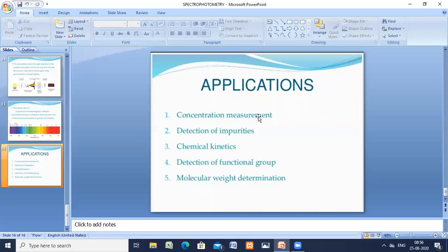All these can be measured spectrophotometrically. Iron reacts with thiocyanate and gives a colored solution. In the colorimetric determination, excess KCNS is added, and strong acids HCl and HNO3 are added to prevent the hydrolysis of Fe3+. The color is measured at 480 nanometers. Standard iron solution is used and the procedure repeated for the calibration.